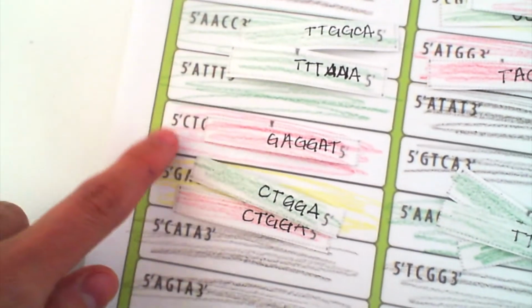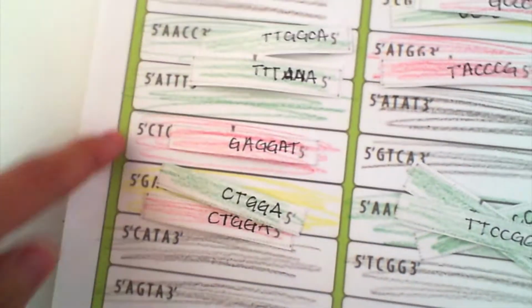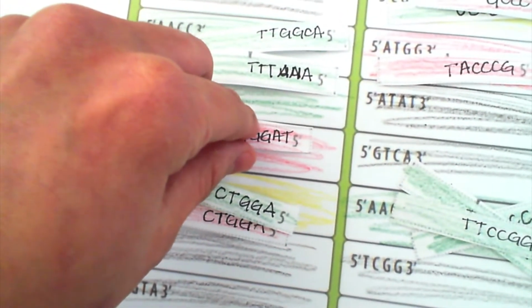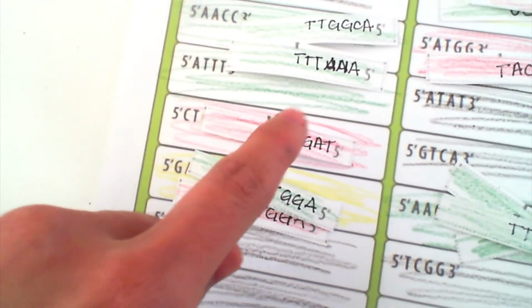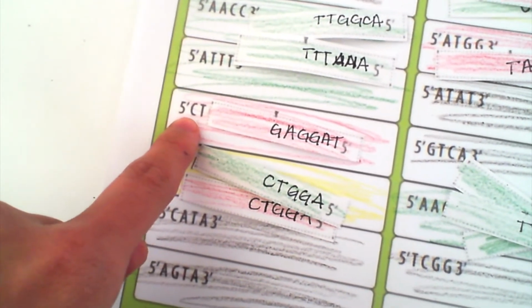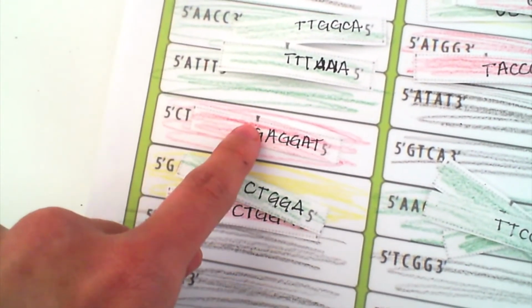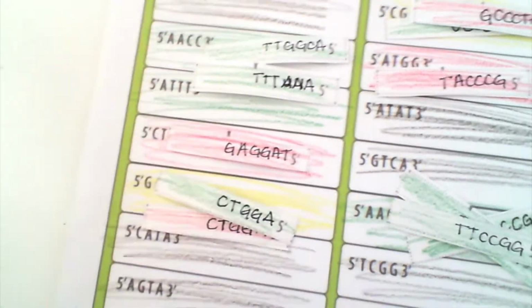Now in the next one, this one right here, it fluorescently shined red because of this one cDNA over here that corresponded to the plant that was not given sunlight. So this means for this particular gene, whatever it represents, it is overly expressed in that plant with no sun. It's not a good thing.